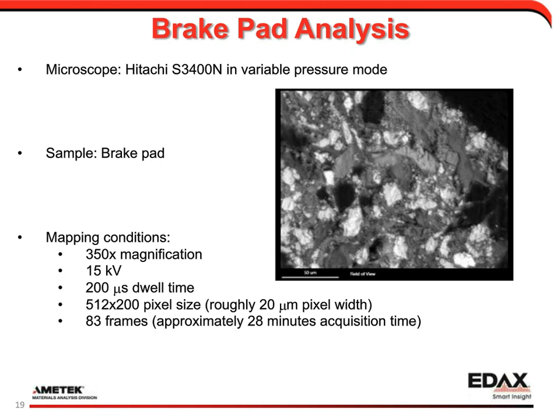The maps I acquired here were 10 or 20 micron pixel width, which is less than the resolution limit of the X-rays. But if you go to very low acceleration voltages, you can see a significant effect of the beam size. We usually say that the X-ray spatial resolution is much worse than your SEM resolution.